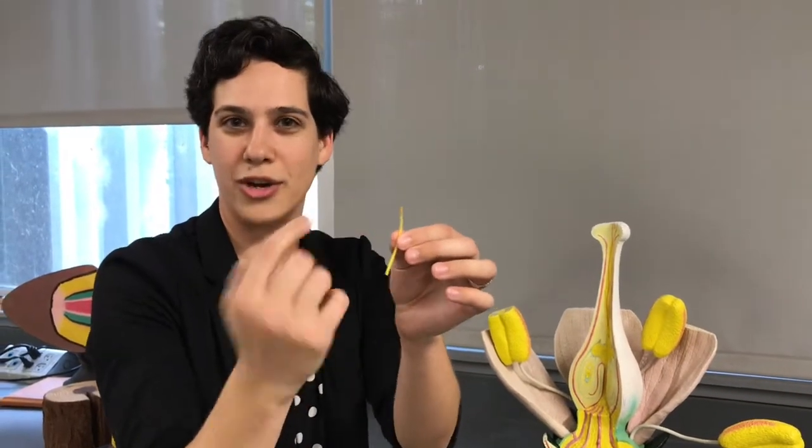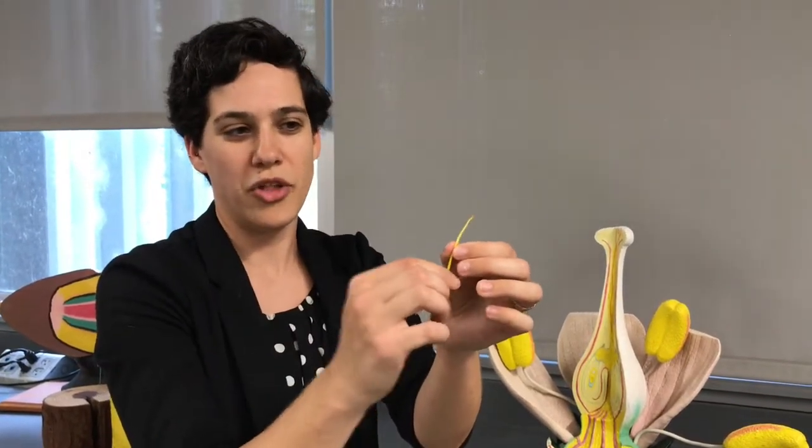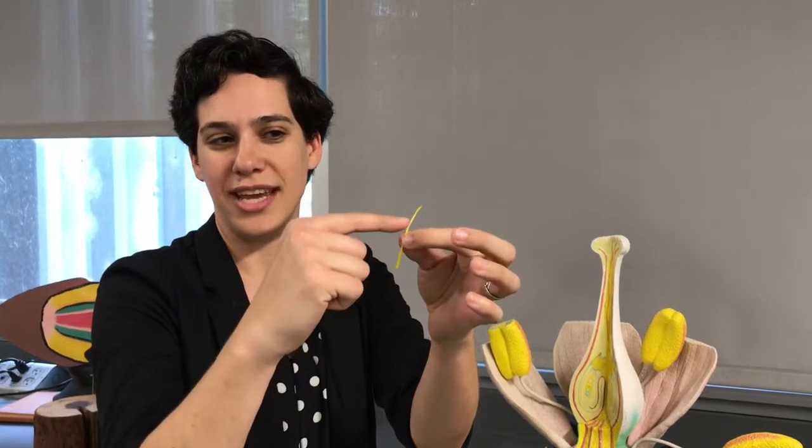That's where you find the pollen grains in the flower. The long stalk attached to the anther is called the filament. And together, the anther and the filament make a stamen.